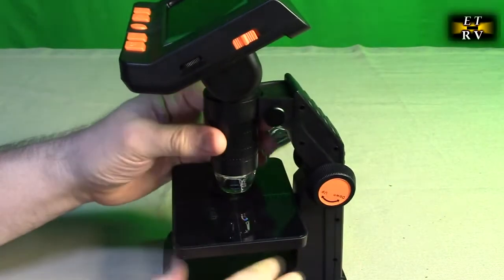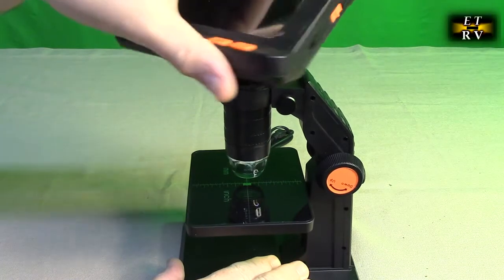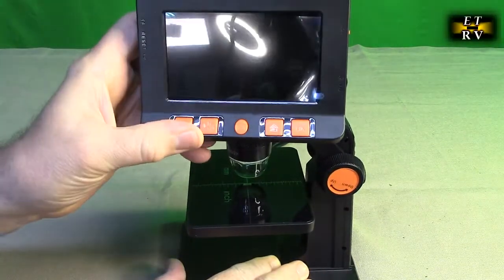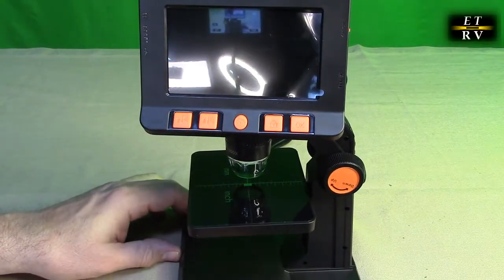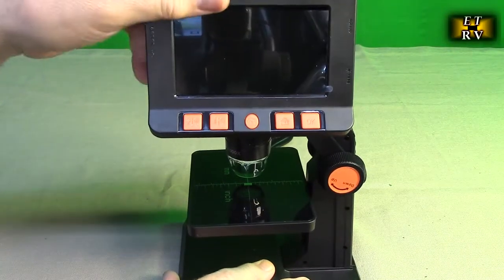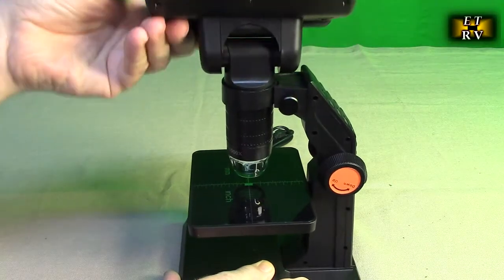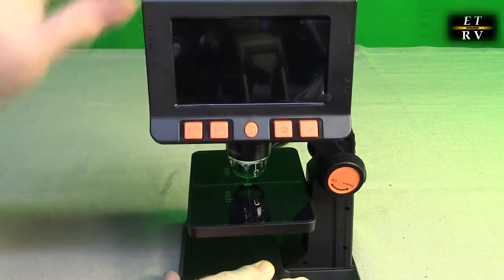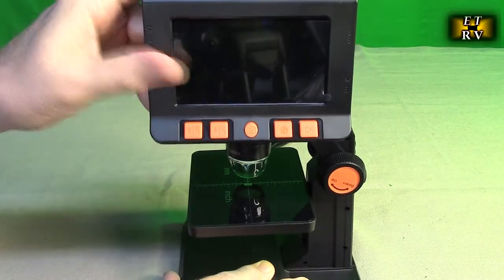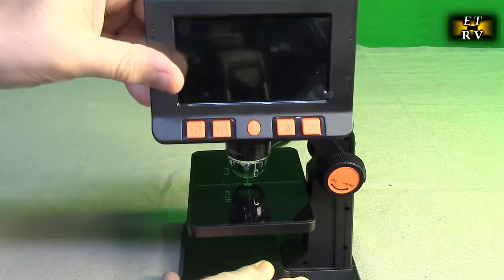Now what's nice is that you can set up and do the focus right there, but you can also rotate this so that if you want to have a colleague or somebody viewing this they can do that. So now I'm looking at 90 degrees or whatever angle I want. You can also change the angle of the top display a lot — they have a way to have the electronics go through this and allow you to move that, so you have a lot of flexibility in the angle of where this display is.